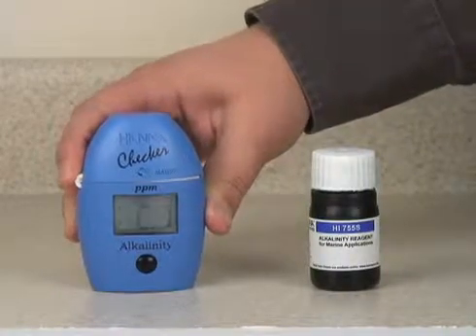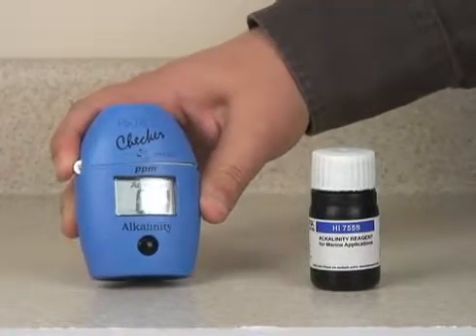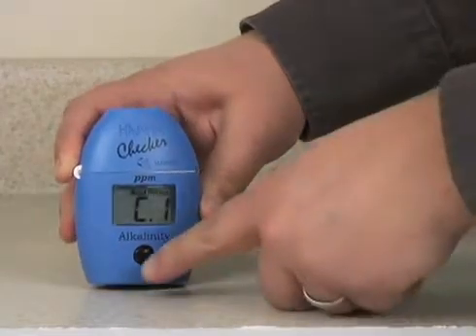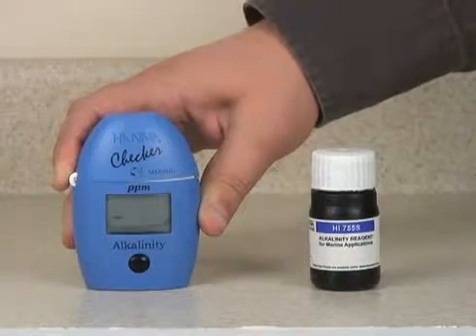Press the button once to turn the instrument on. When you see the message C1, the instrument is ready to be zeroed. Press the button again to zero the instrument.